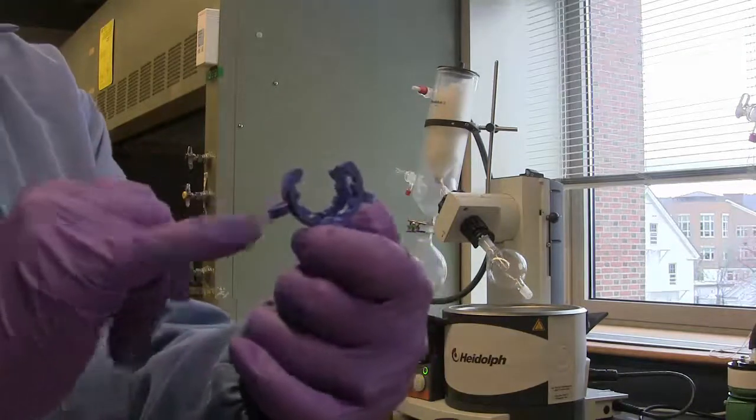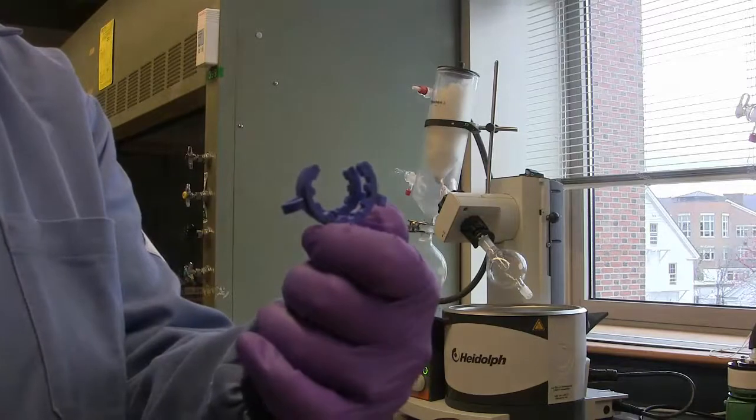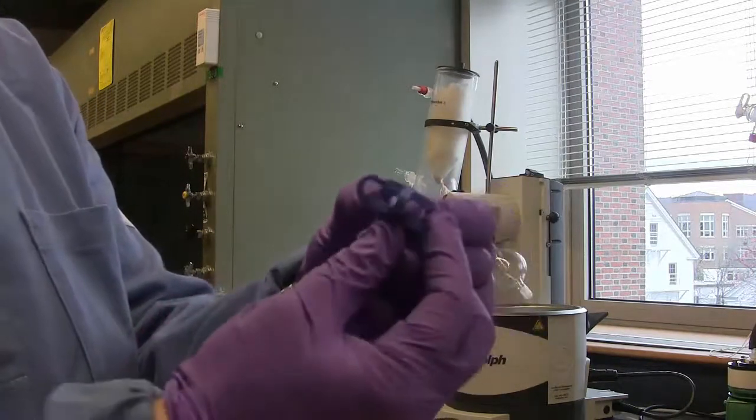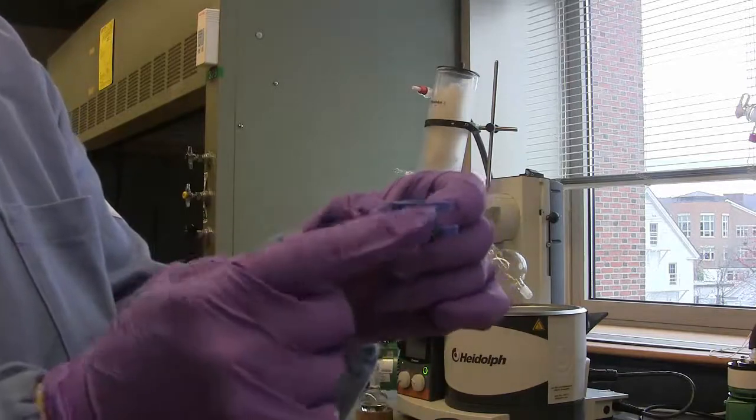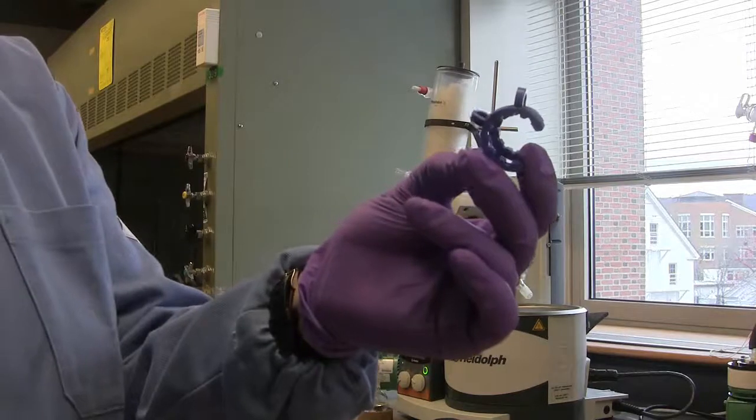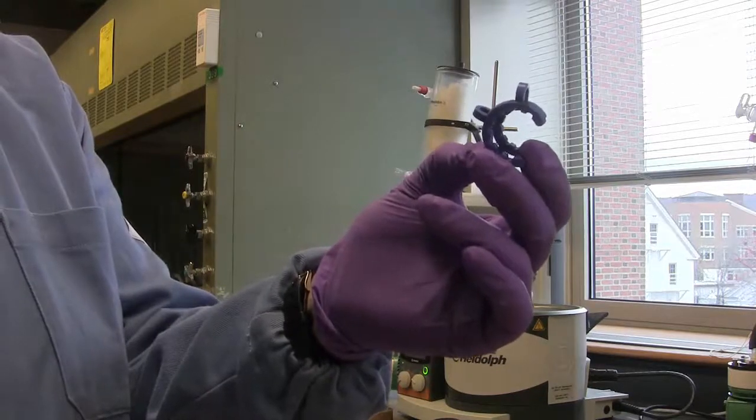And the larger piece should go onto the round bottom flask, or the female joint. Before using a Keck clip, it's always good to check the plastic bridges and make sure that there are not any cracks in the Keck clip. If there are, simply throw the clip away and ask for a replacement.